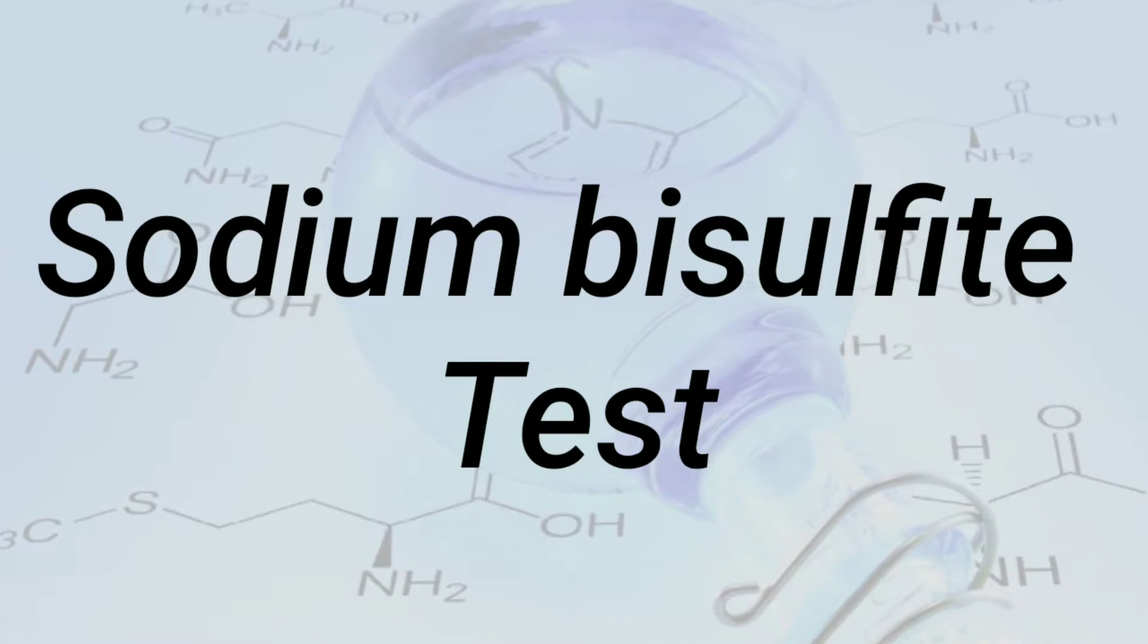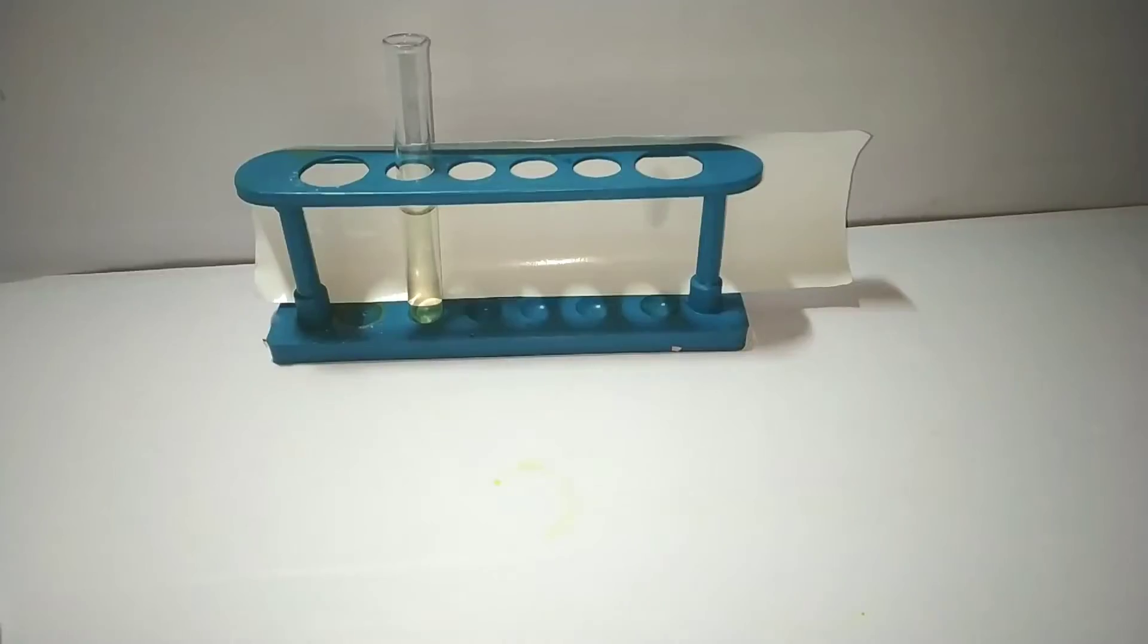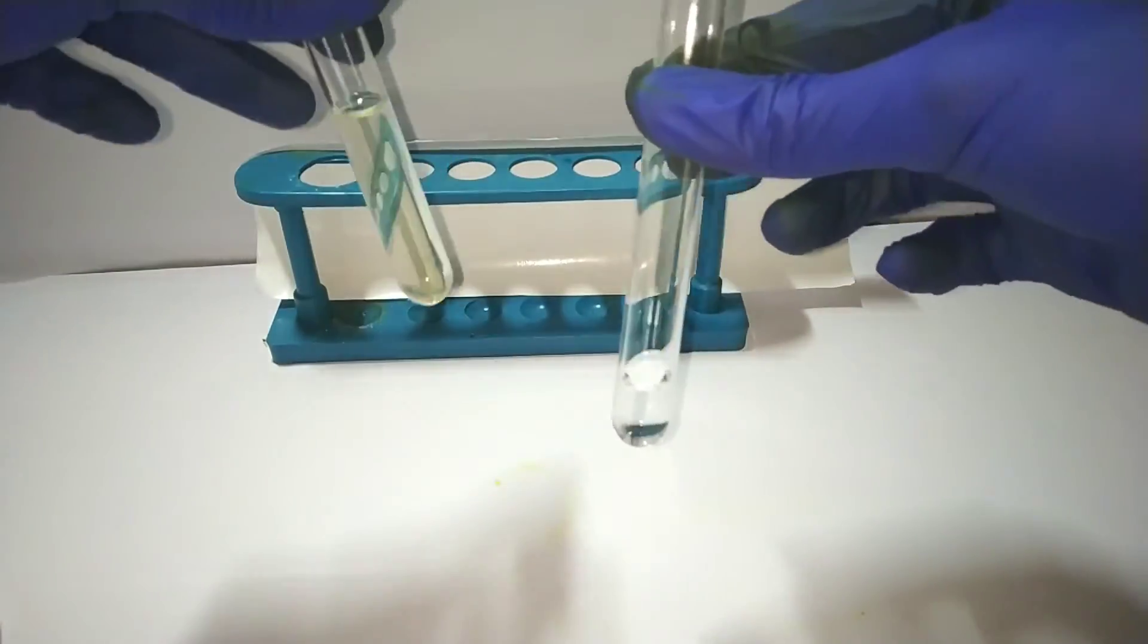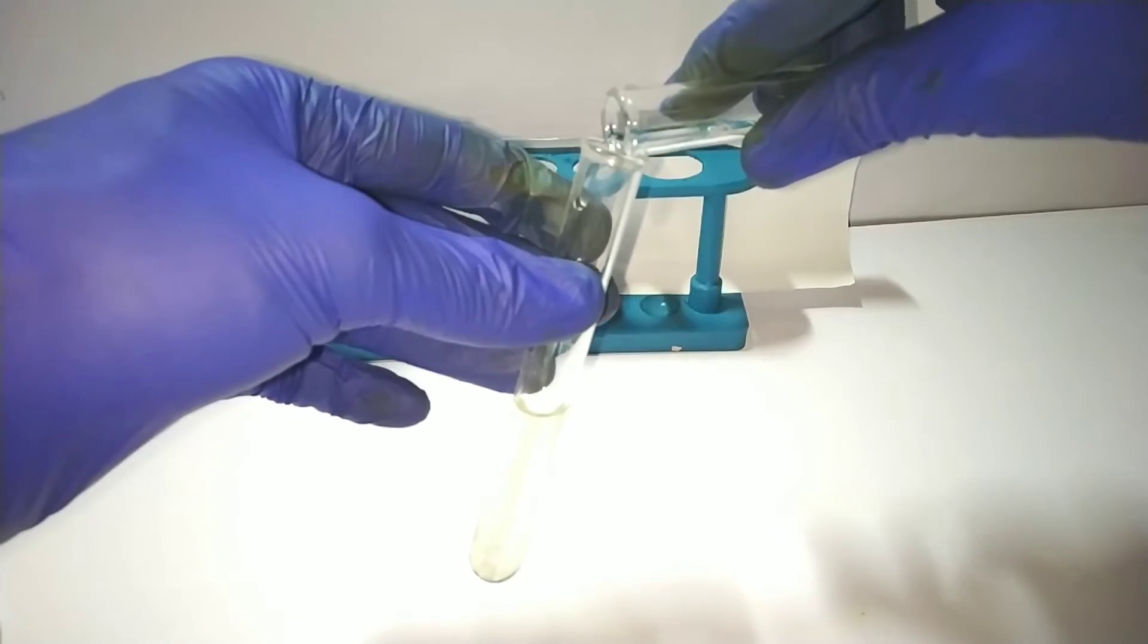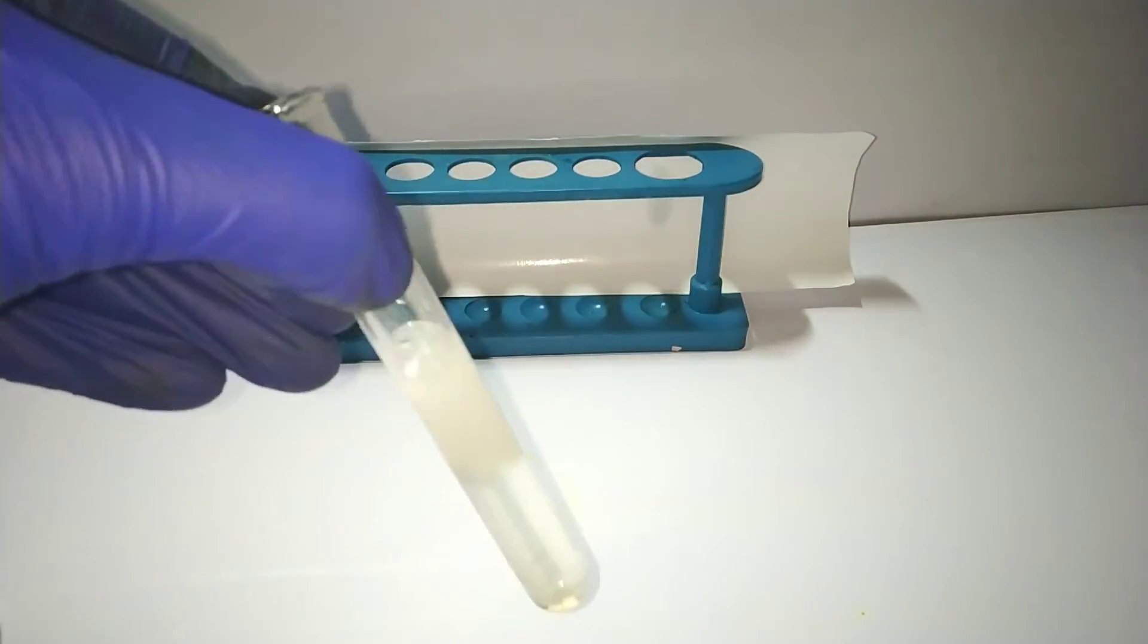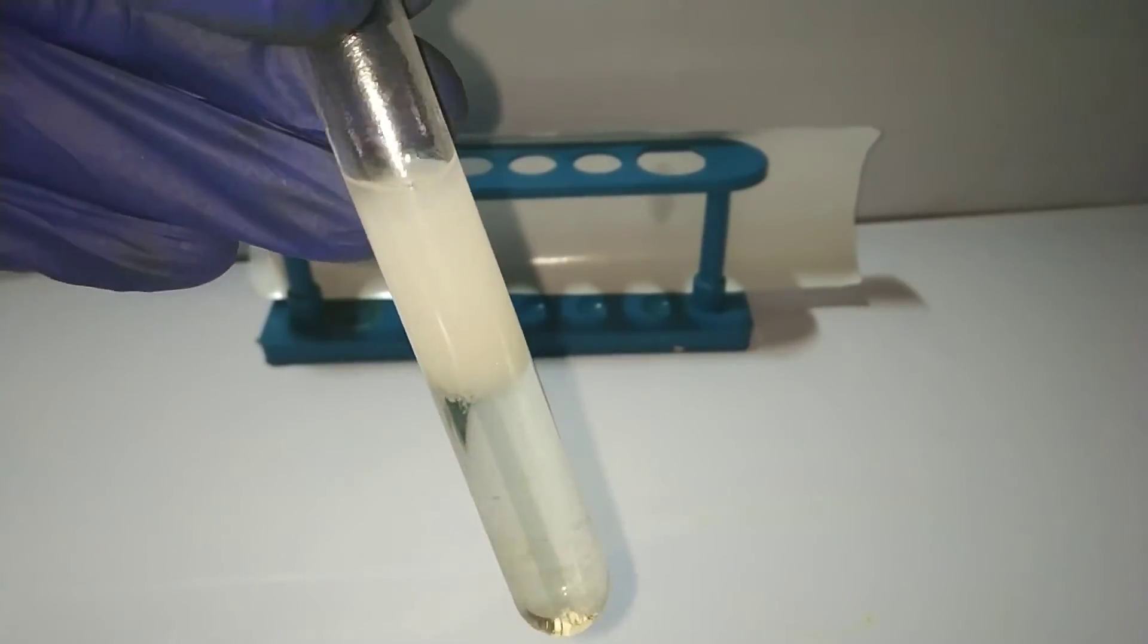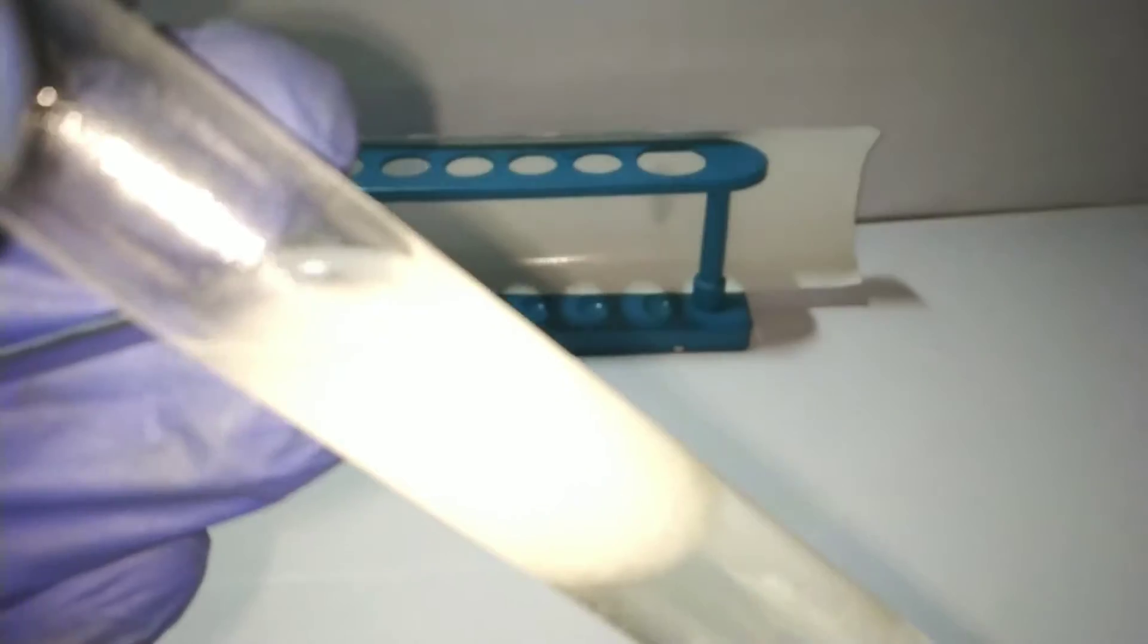Sodium bisulphite test. For this test we need a saturated solution of sodium bisulphite. Into that we add the organic compound. On adding that, it forms a crystalline product which is a bisulphite adduct, and the reaction is shown above.